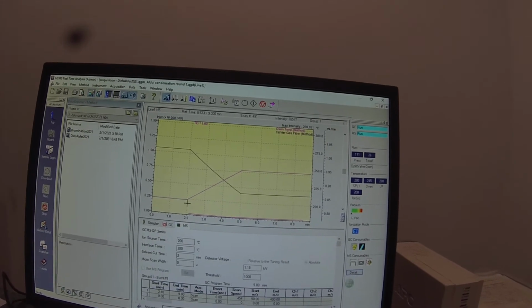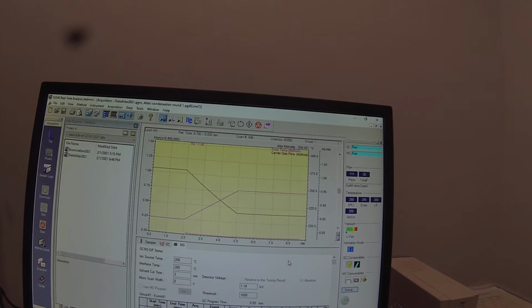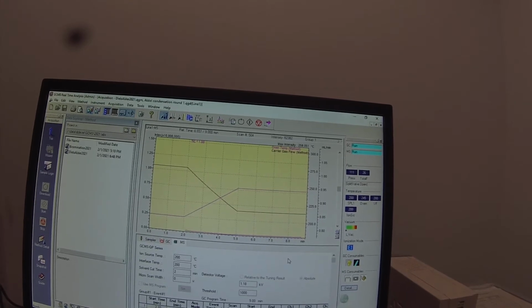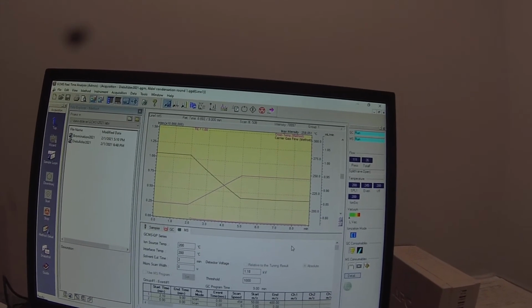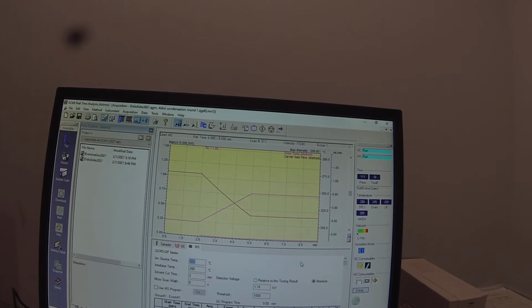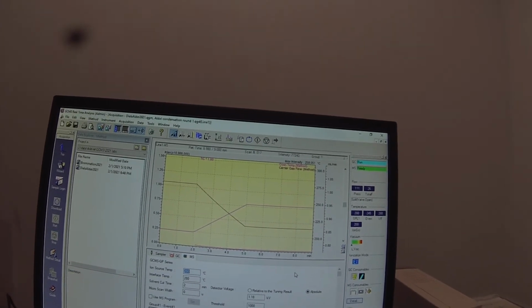As I say, I don't think it's because it came off too quickly. I suspect it's because it's not off yet. So I'm just waiting for this to finish, and then I'm going to go and edit that method, while it cools.